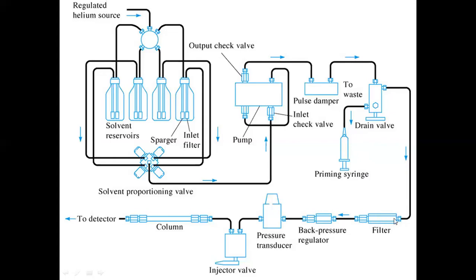This pre-filter is required in order to remove the particulate matter present in the mobile phase which escaped from the solvent reservoirs before.